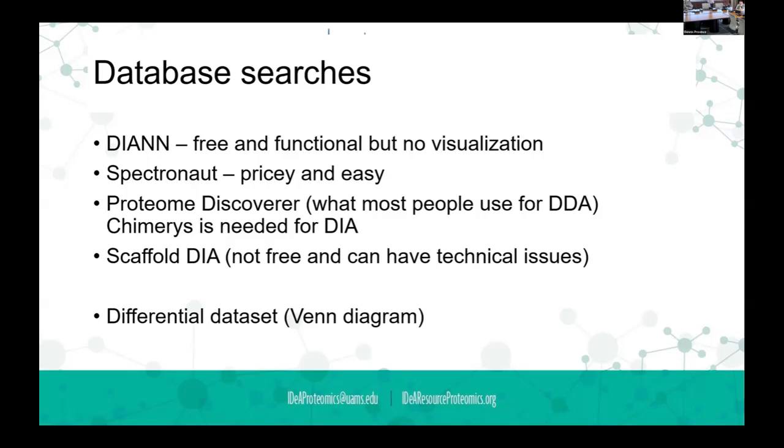We started using Spectronaut, and it did well. I mean, we're getting crazy. We're opening up four or five searches all at the same time on the same computer. That thing is just going nuts.